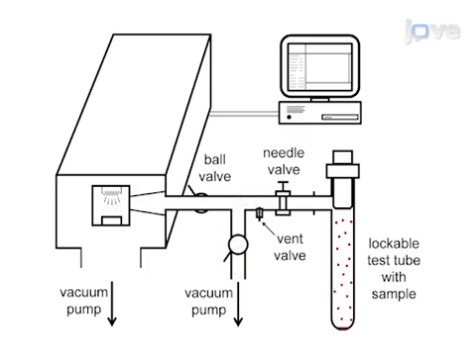In the final step, the sample is carefully leaked into the mass spectrometer by opening the needle valve of the cold inlet system, and a mass spectrum is recorded.